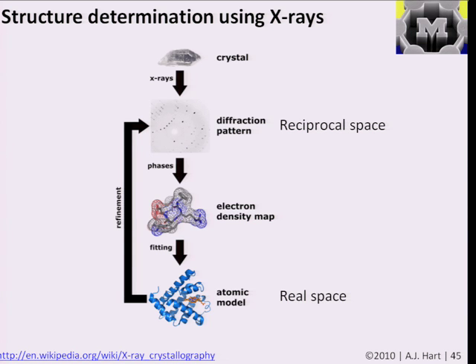Okay, so the next topic is getting into ways of quantitatively determining the structure of materials using X-rays. This schematic shows a generic process for using an X-ray beam, which is in some ways like an electron beam, to do what's called X-ray scattering or X-ray diffraction and create a representation of your material in 3 dimensions. This technique goes very far, for example, to understanding the crystal structure of proteins by biologists, as well as understanding, at a more simple level, whether you have an FCC material or a BCC material if you're looking at a bulk metal or a nanoparticle inside an electron microscope.